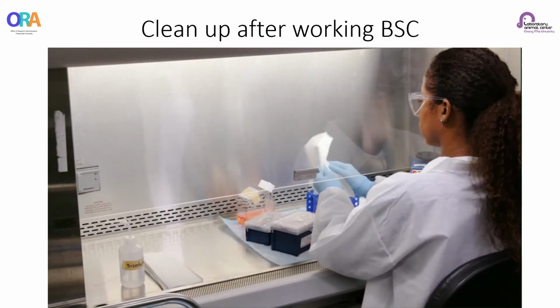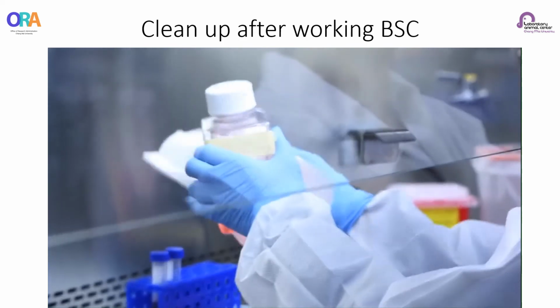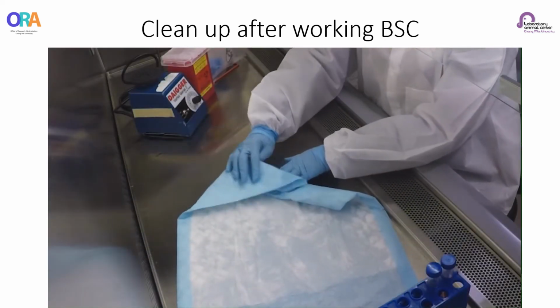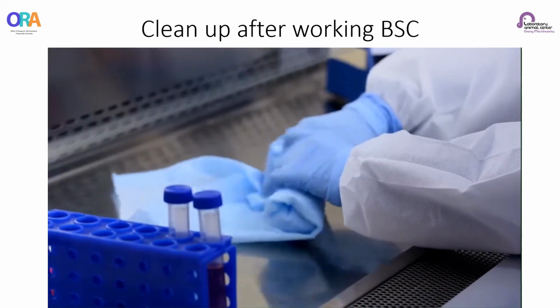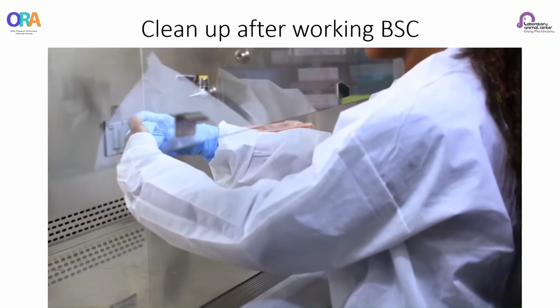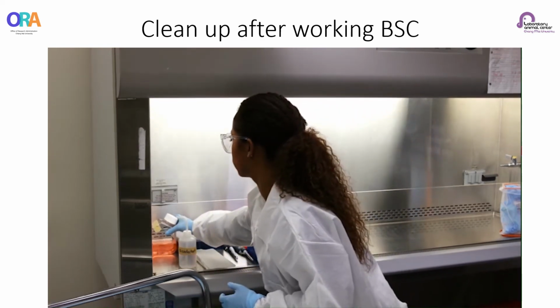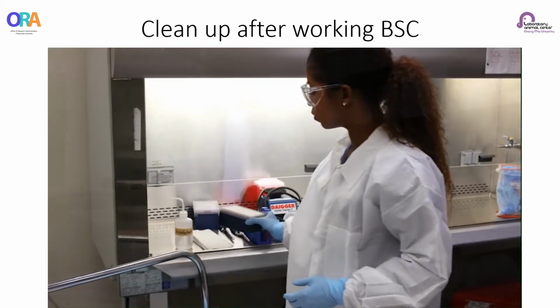After the appropriate contact time is passed, remove any residual wetness and place the materials that will remain in the cabinet on the designated clean side of the cabinet. If a blue absorbent pad was used, discard it into the biohazardous waste container by grabbing the outer corners of the pad and folding it inward. Remove other materials from the BSC, placing them on your cart.